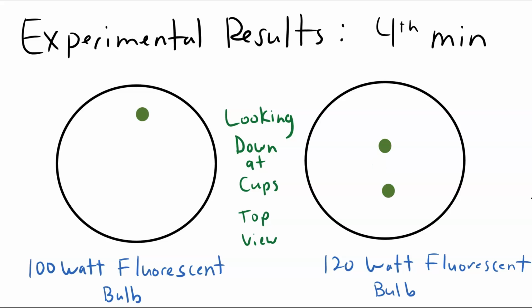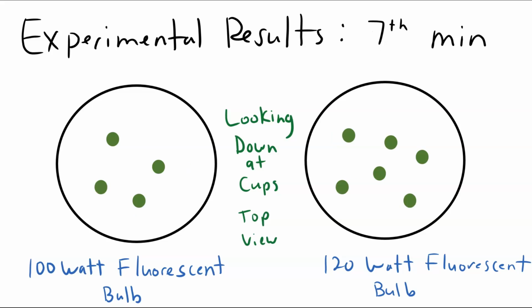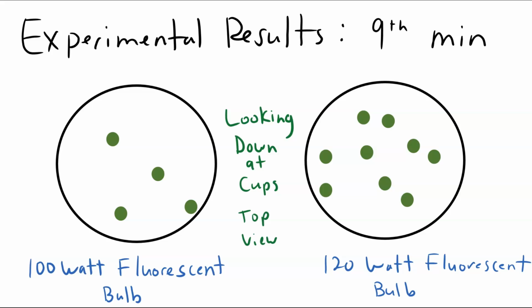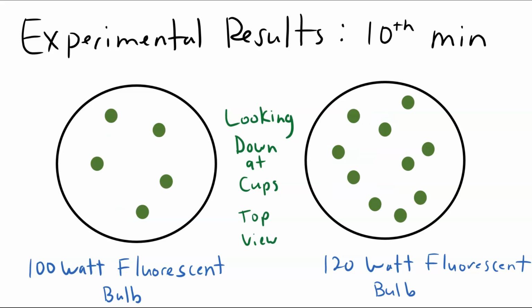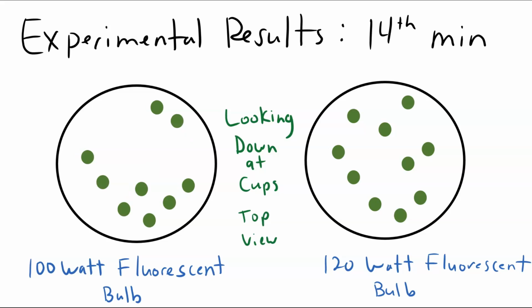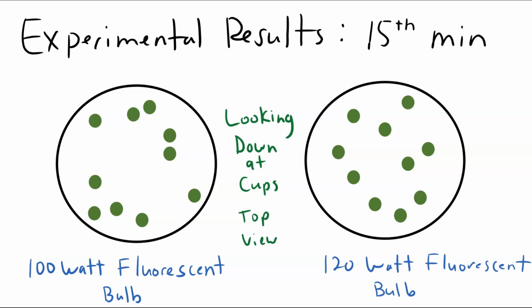at the end of the 4th minute, at the end of the 5th minute, at the end of the 6th minute, at the end of the 7th minute, at the end of the 8th minute, at the end of the 9th minute, at the end of the 10th minute, at the end of the 11th minute. You can pause this. Obviously, I'm going a little quickly through here, but pause it and record your data. End of the 12th minute, end of the 13th minute, end of the 14th minute, and end of the 15th minute.